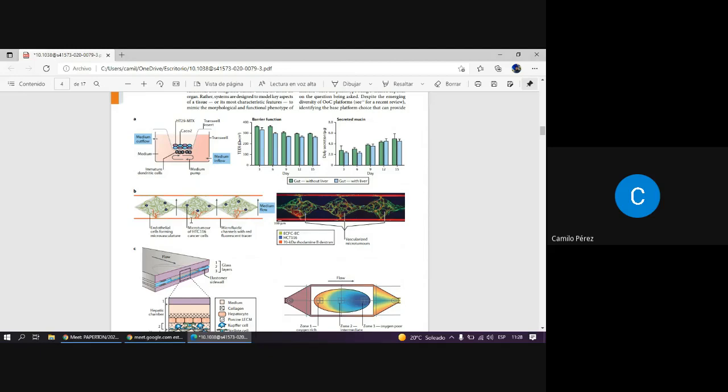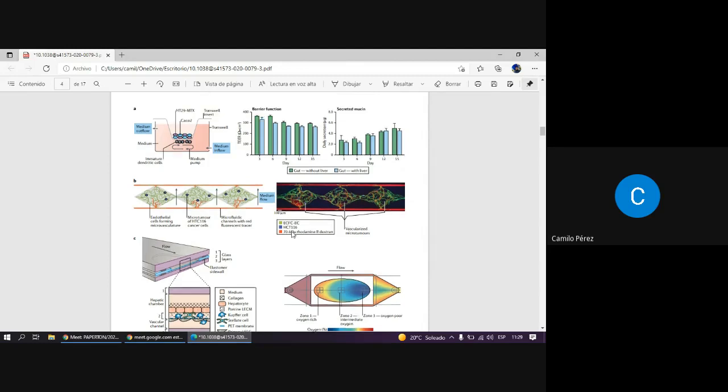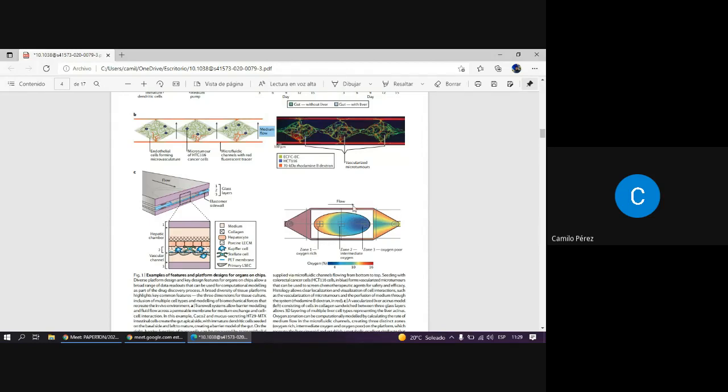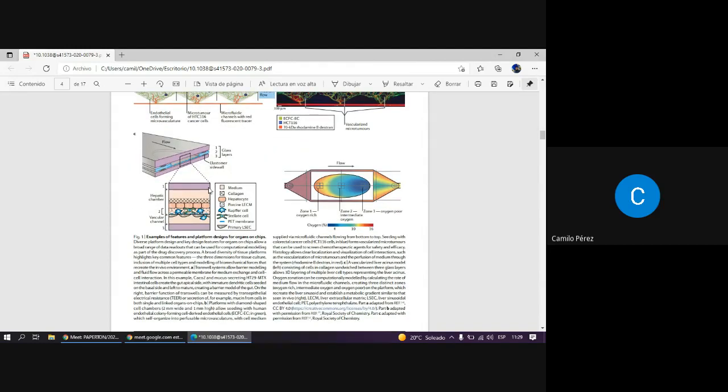And you can see there exist different micro devices that produce low oxygen. For example, in our laboratory for producing low oxygen we use another system, which is big. In this case, when I use a micro device to reduce the oxygen, I can see the behavior of cells in a culture or their reaction to different variables in the experiment, right?